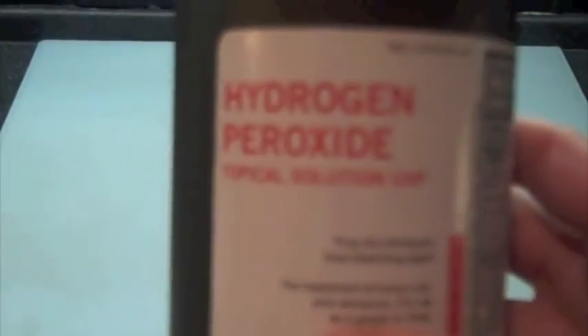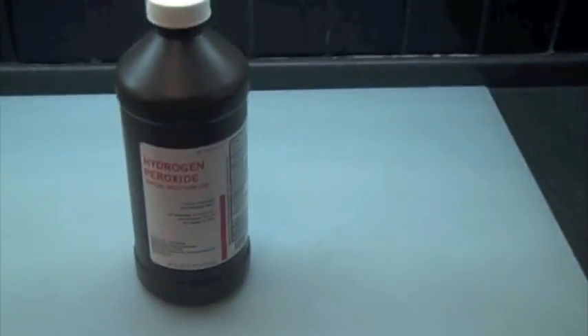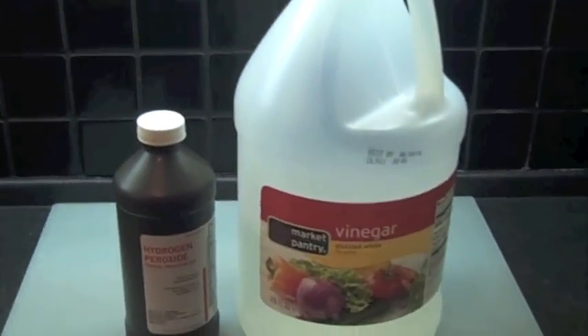Today I will be making a solution of copper acetate. For this you need 3% hydrogen peroxide — it doesn't really matter on the percentage. And you need some 5% acetic acid or vinegar, whatever you call it.